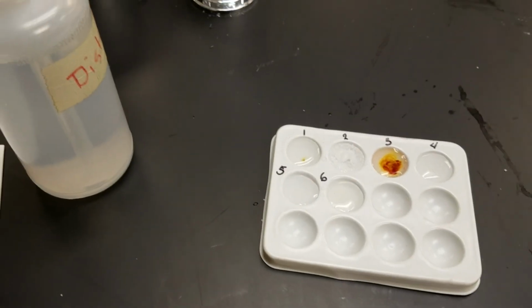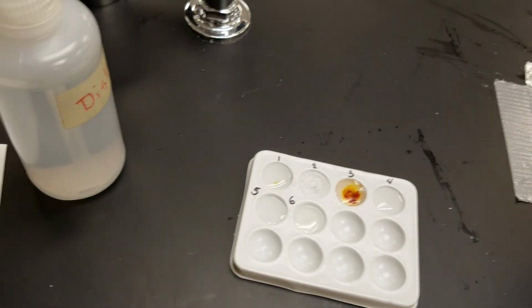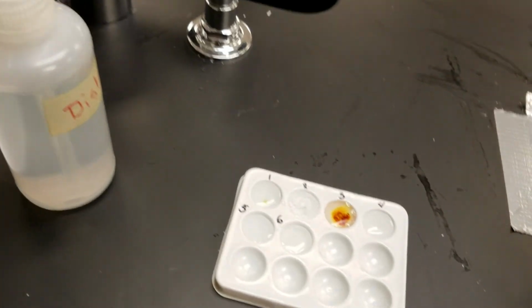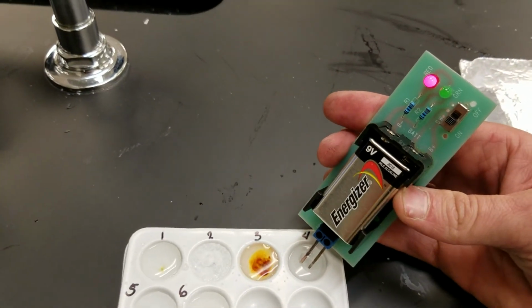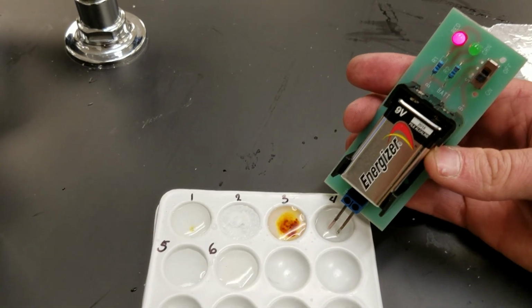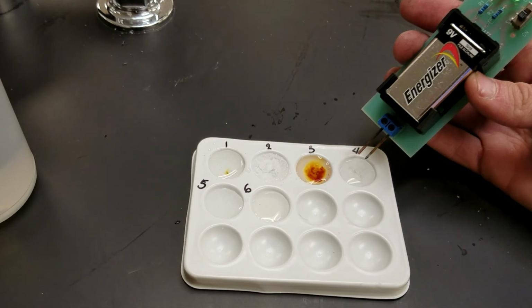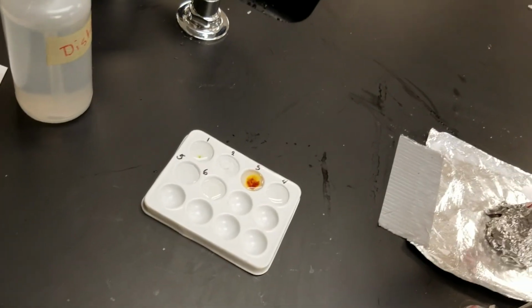Let's dry this off. Try the next one, which is sucrose. Let's see if sugar water will conduct electricity. Low conductivity. That red light comes on, but there's nothing on that green light. So, low conductivity for sucrose.